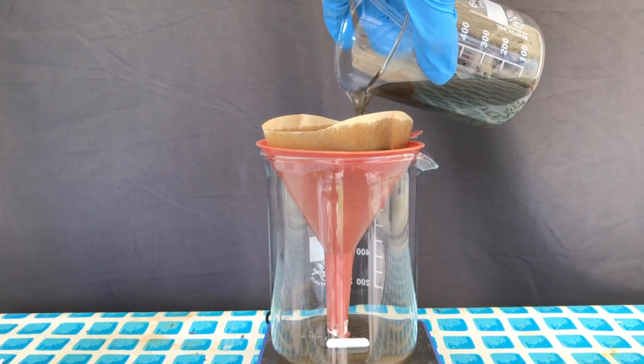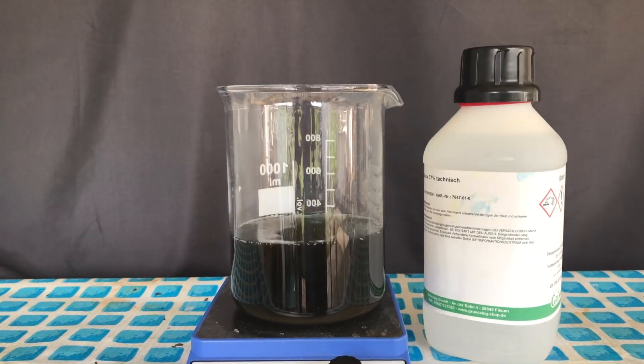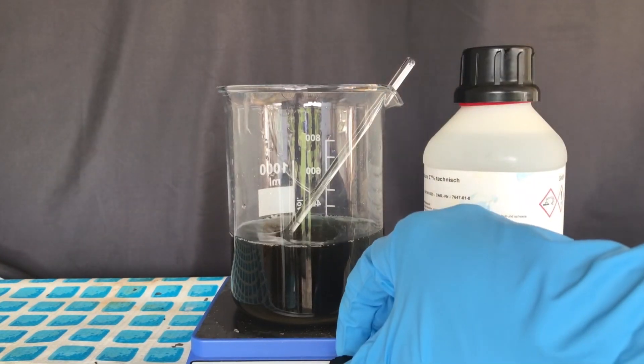I hope that the sodium hydroxide didn't dissolve the filter, but it worked out just fine. The solution was black because a lot of the iron from the steel can was dissolved as iron hydroxide or something like that.